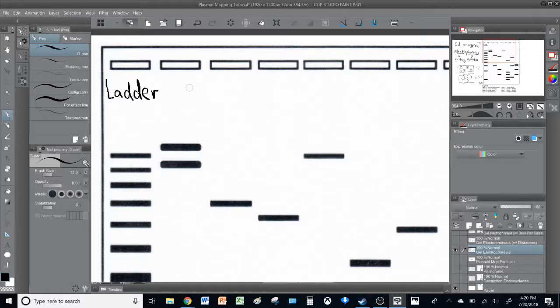This lane contains an uncut plasmid. Honestly, I do not know why it's included in the assignment because you really do not benefit from it at all, but I guess it's to show supercoiling, because the only reason you'll get two bands is if this is the heavier band, then the DNA supercoils, becomes smaller, and then you get another band emerging at the bottom.